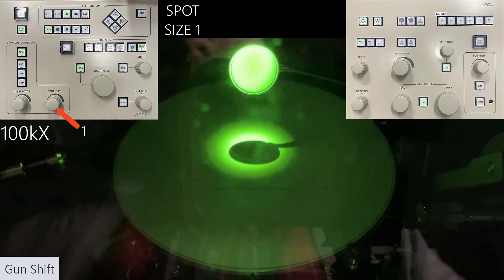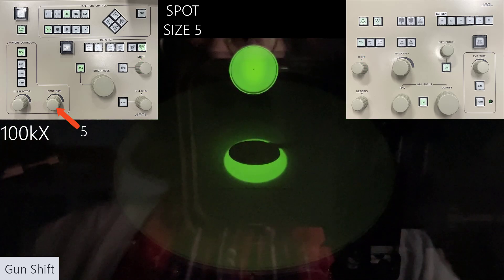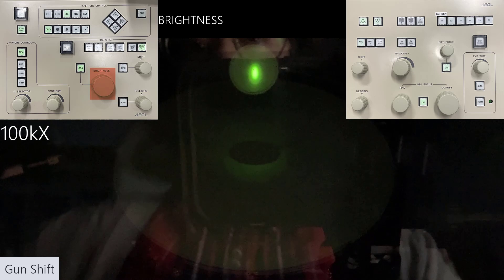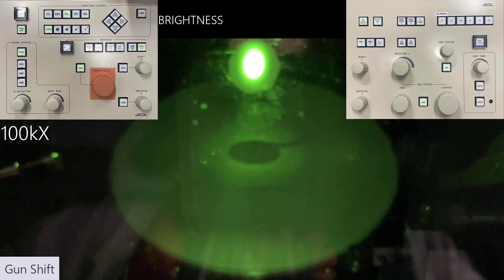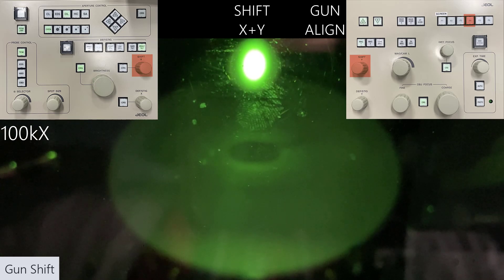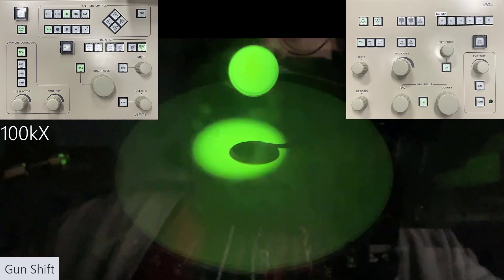It's a bit difficult to see where center of the screen is, so I put down the mini phosphor screen to help guide me — and you can see it's off-centered quite a fair amount. Select the bright tilt button and use shift X and Y knobs to center it. Then go back to spot size 1, condense the beam, select the gun align button, and use shift X and Y knobs to center the pattern again. Iterate: at spot size 1 use the gun align button and shift X and Y knobs; at spot size 5 use the bright tilt button and shift X and Y knobs. Repeat as many times as needed until switching between spot sizes 1 and 5 produces minimal pattern shift.